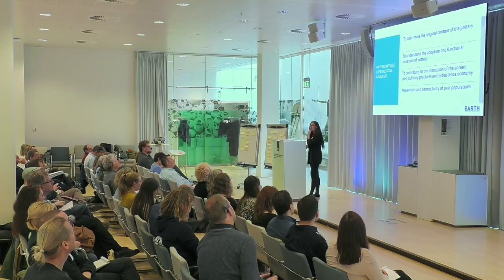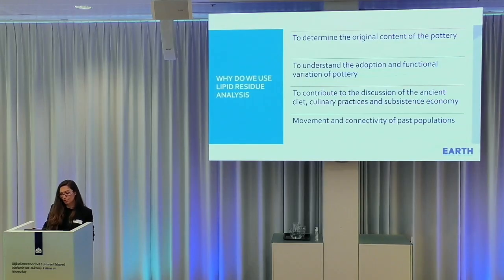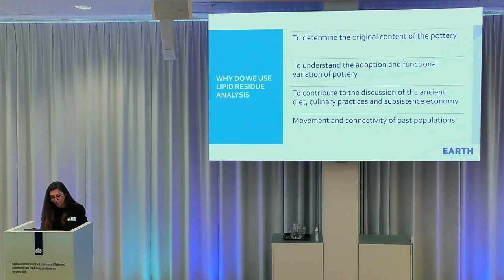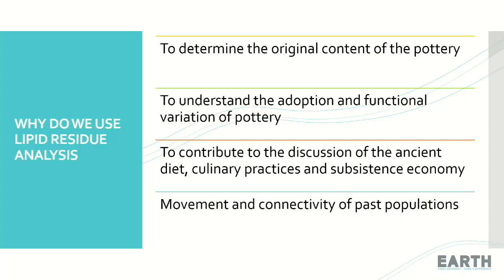And, well, why do we use lipid residue analysis? Well, the first reason is very clear, since we've been mentioning it all the time today. We want to determine the original content of the pottery. We want to understand what was cooked in the pottery, what was processed in the pottery.